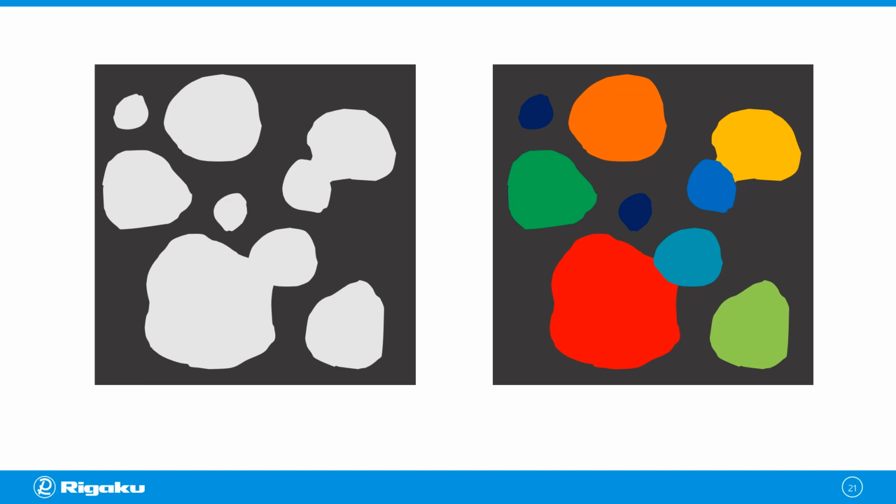Once you do the segmentation, you usually end up having just the solid, or grains, and air, or the pore space. Now, if you want to do grain size distribution analysis, for example, you need to separate the individual grains. And that part is called object separation, and the results would look more like this. And once you do this, you can start running quantitative analysis.